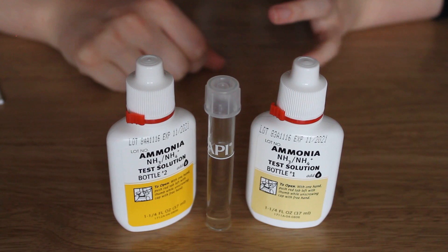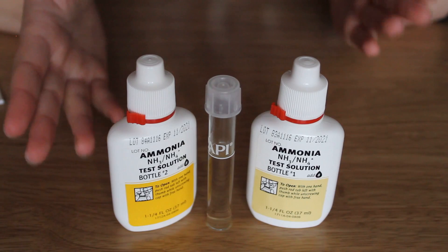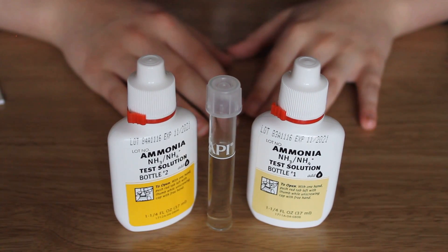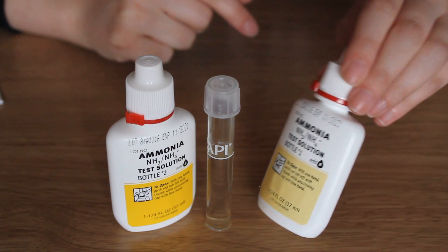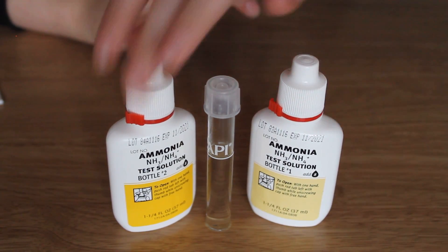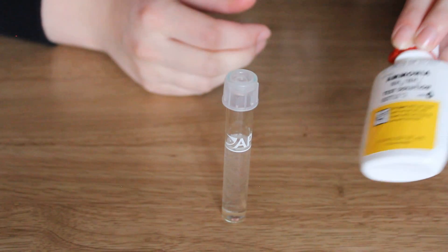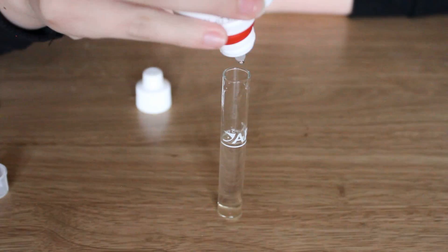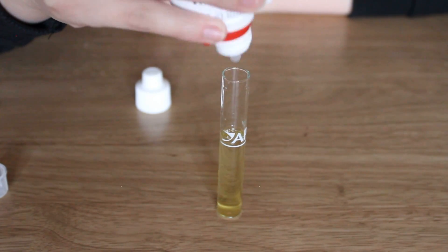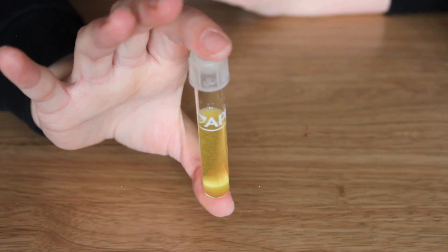Once again aiming for zero but let's face it it's probably not going to be that. We have two bottles and bottle one you need to shake up and then add eight drops. Take bottle two, shake it up and add eight drops of this. Then we're going to leave that to settle for a bit and then we get our result.